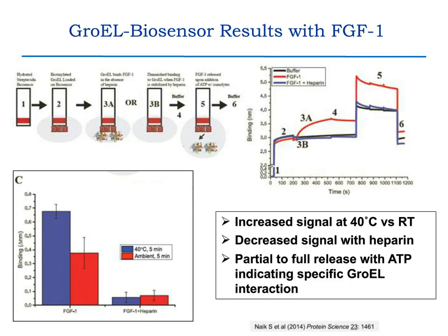The individual steps of this experiment are shown across the top, and I don't have time to go through that today, but it's outlined in detail in the paper. For today's discussion, you can see that there's an increase in the signal, there's a decrease in the presence of heparin, and as shown in the wash steps on the top, we got full to partial release when we added ATP, showing that this interaction is specific to GroEL.